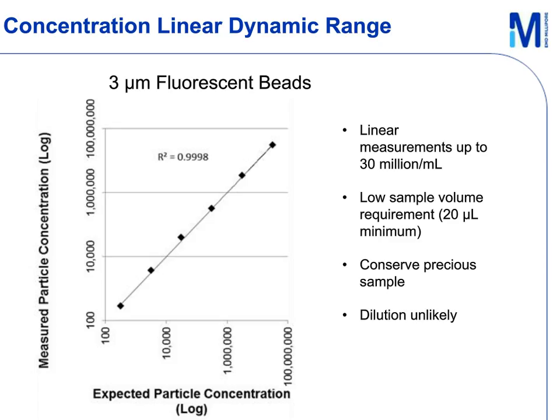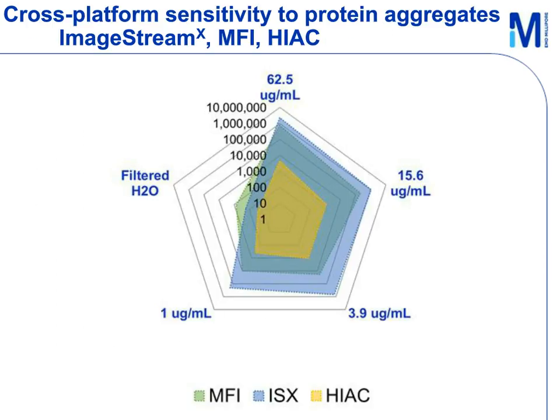One last set of data that I want to show you is comparative data counts measured for IgG protein aggregates using the ImageStream-X, MFI, and HIAC. One challenge for measuring protein aggregates is evaluating the sensitivity of the analytical method used because validated reference standards for protein particles are not yet commercially available. Often, the sensitivity of instruments is evaluated using polystyrene beads of known size and concentration.